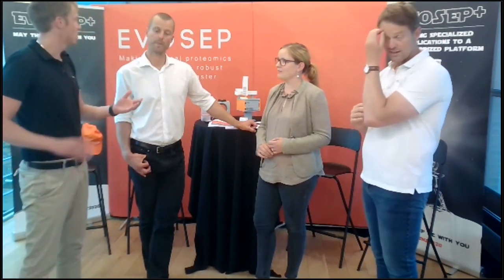We're also happy to start working more actively with Agilent this year. We did formally engage in a co-marketing agreement where we did some hard work. You went to Santa Clara about half a year and more ago. And that got turned into an application note that was released here at ASMS together with a press release. So Agilent is interesting because they have a different reach. For us, it's interesting to work with these companies. And they perhaps have a slightly different focus on triple quadrupole instruments, where, again, much of the work we've done in the past has always been with high resolution instruments.